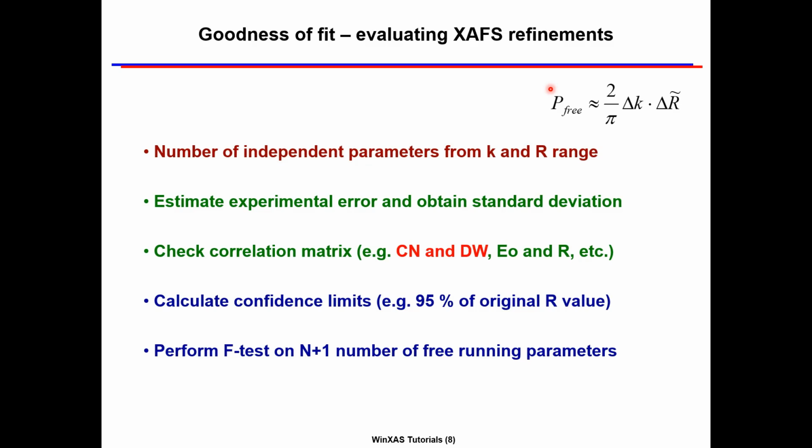However, parameters may be heavily correlated, even well below this number. Second, standard deviation and correlation matrices are calculated by the least squares refinement procedure and can be of help identifying problematic parameters. Even better suited and with a more meaningful results are confidence limits.